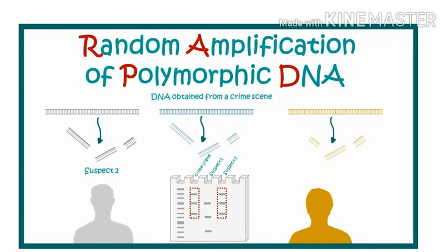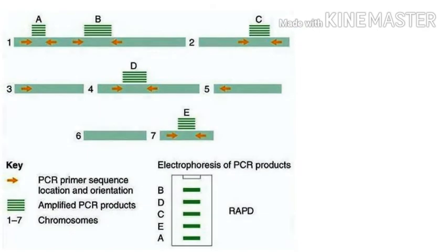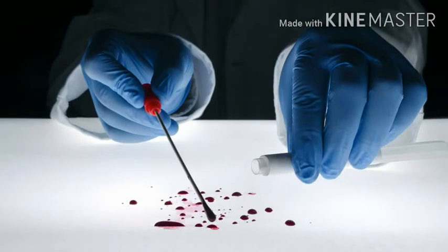Randomly amplified polymorphic DNA, or RAPD, is usually found in the plural as RAPDs and is pronounced "rapids", partly because it is a quick way to get a lot of information about the genes of an organism under investigation. The purpose of RAPDs is to test how closely related two organisms are. In practice, DNA samples from unknown organisms are compared with DNA from a previously characterized organism.